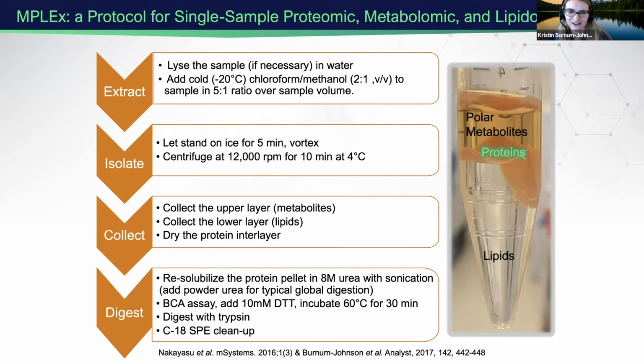So when the protein is denatured, it loses its tertiary and secondary structure. So it's just a protein that becomes unfolded, and now it exists as a linear string of amino acids. Then trypsin is added to make peptides. Since the protein is denatured, trypsin can easily cut proteins into peptides at lysine and arginine amino acid residues.